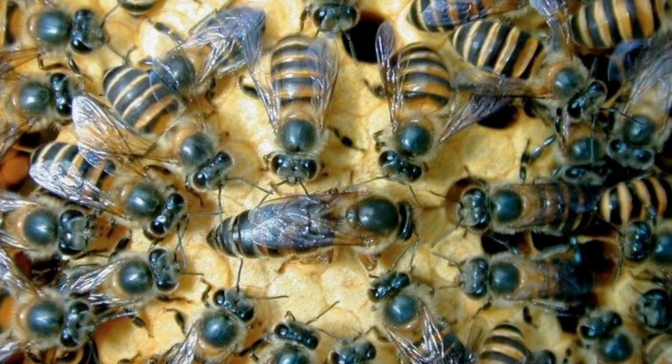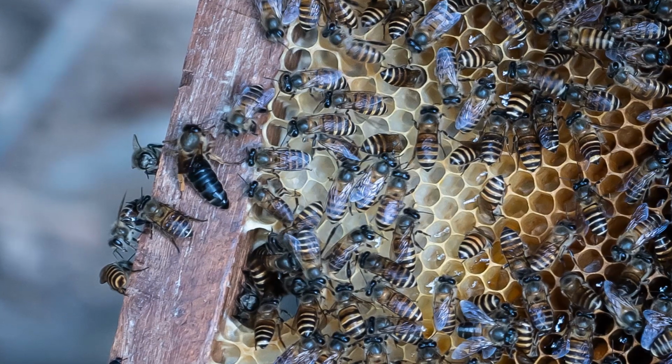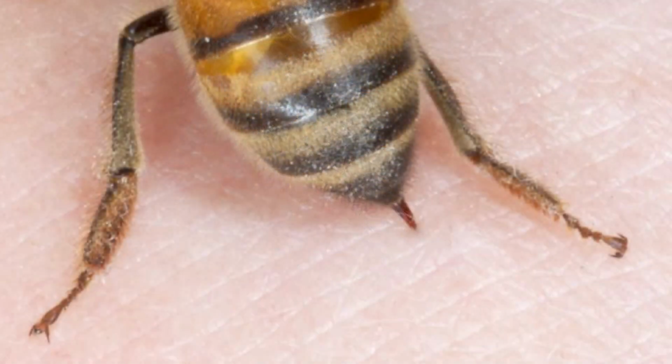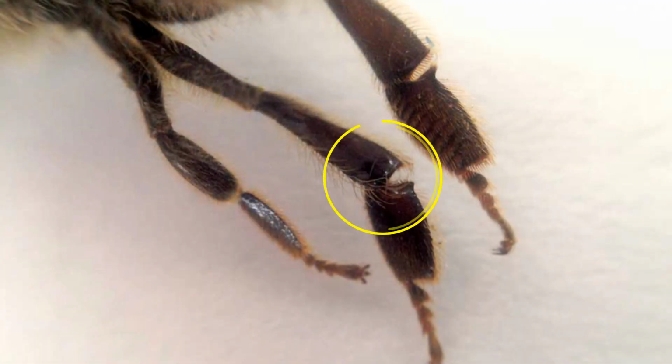Workers are unfertile female, which are smallest in size. The abdominal segments bear wax glands, which are present ventrally on the 4 posterior abdominal segments. A sting is present at the end of the last abdominal segment. Pollen collecting baskets are present in the thoracic legs of workers.